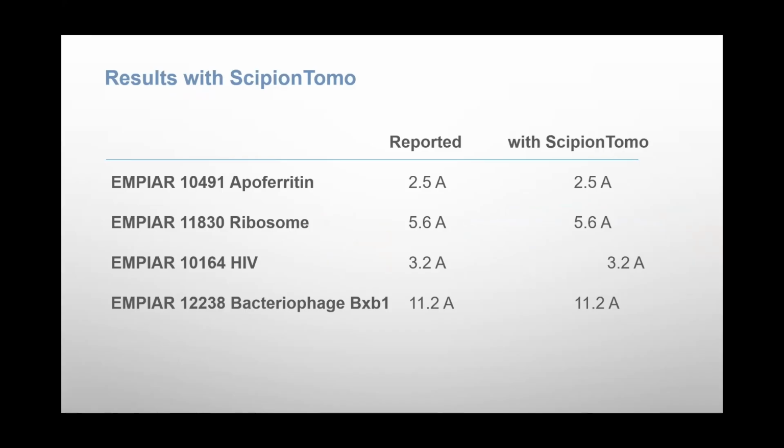So with these data sets and other ones that belong to users that have used ScipionTomo for their image processing, but there is no previously reported resolution.